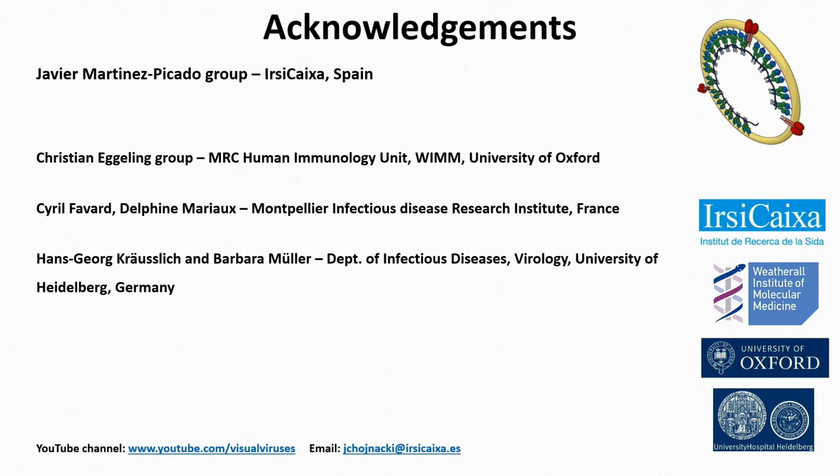Yes, you can. Right now, the post-entry stages and disassembly as well. Originally, assembly and entry were the first things studied because they're relatively easy: you can study surface molecules more easily. But right now, thanks to advances in labeling and click chemistry, for example, we can study those more advanced and deeper steps of the HIV replication cycle and combine them with superresolution microscopy. The group in Heidelberg, my former boss, has made headway into it. They were one of the first to study post-entry stages, the capsid uncoating, and were the ones who found the nuclear deposition of the capsid, and also looked at the perinuclear stages of the virus replication cycle. So yes, since the field has advanced so much, you can study all these not-easy parts of the HIV replication cycle, definitely. And of course trans-infection, as in the synapse, and so on. It's all possible right now.